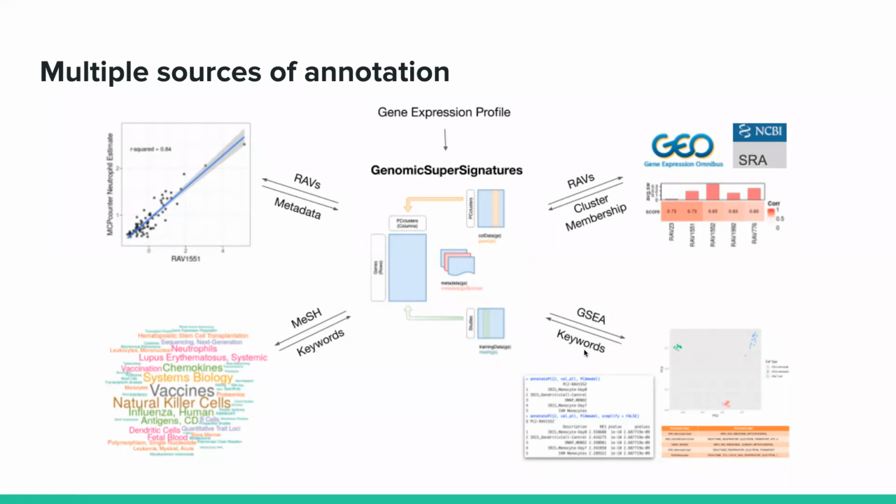Another one is through gene set enrichment analysis. So these loadings provide what you need to do a pre-ranked gene set enrichment analysis, and all of those are pre-calculated.